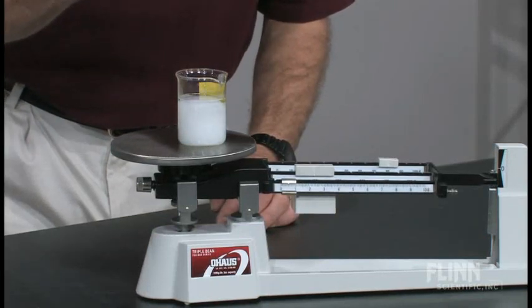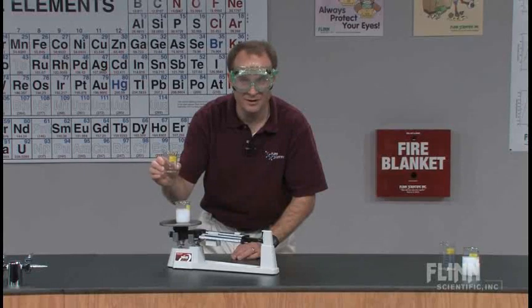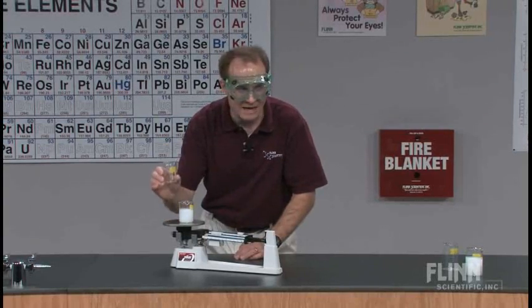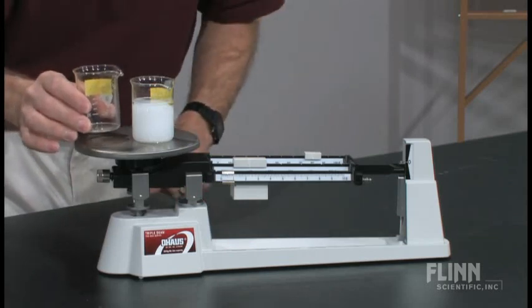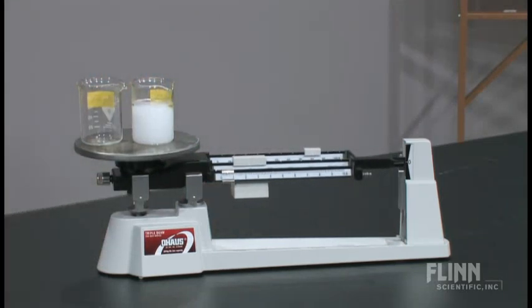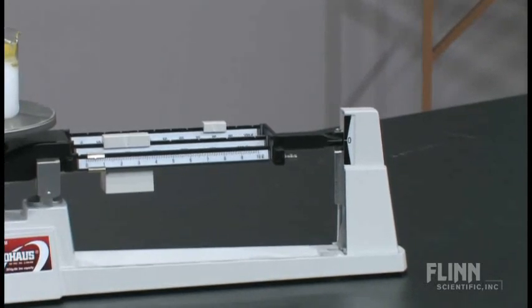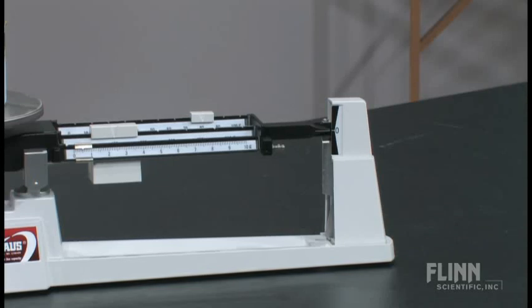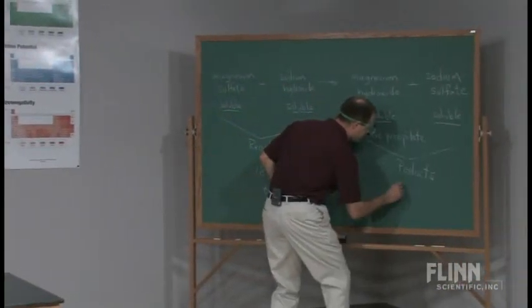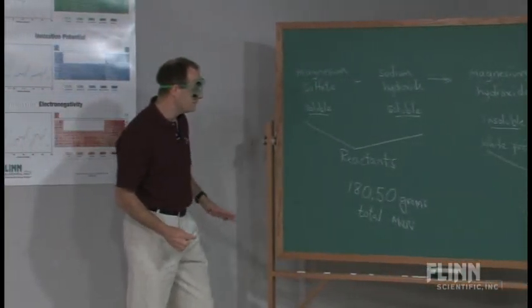At this point, every student in your class cares, and you control everything. Hurry up and put the beaker on the balance, Mr. Bracken. Yes. And if we focus right here, we should see the mass before equals the mass after. 180.50. 180.50.